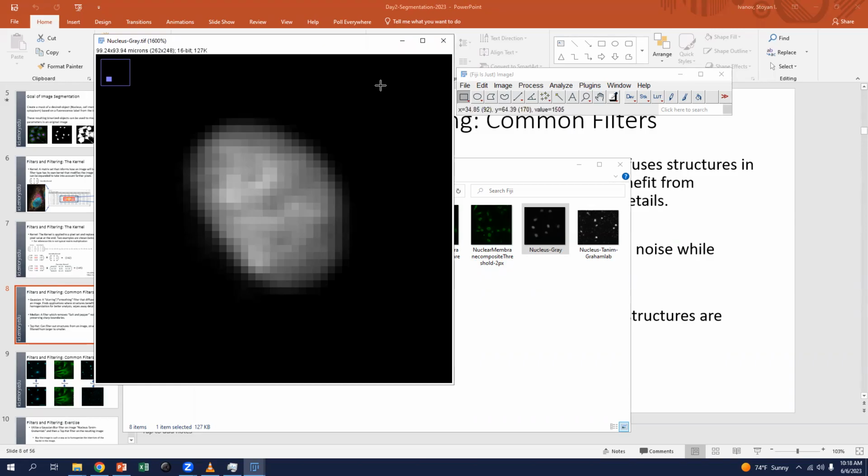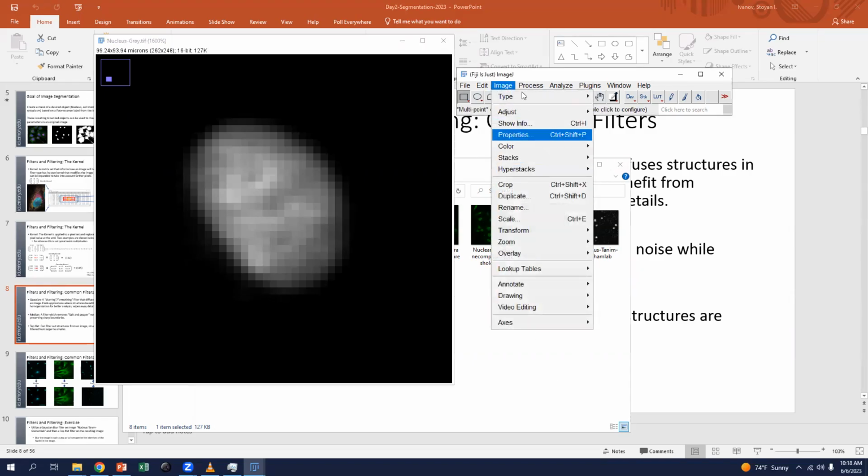And when you're trying to segment it, even though you know it's a cell you're segmenting, the algorithm might say, well, there's this little gap in here. And that could be for a number of reasons: lack of fluorophores, lack of signal, presence of noise. But if we want to create an accurate segmentation of the cell, we might want to run a median filter through it so that those gaps can then be closed. And what does that look like?